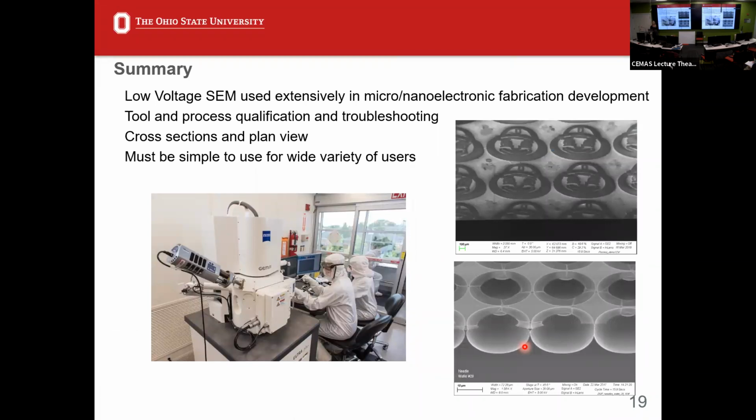So that's pretty much what I wanted to talk about. I want to use some time for a discussion. But basically, I wanted to share why we use low voltage SEM. We use low voltage SEM pretty much every day. In fact, when the tool goes down, a lot of things stop, like today, unfortunately. So we do it for many, many different things.